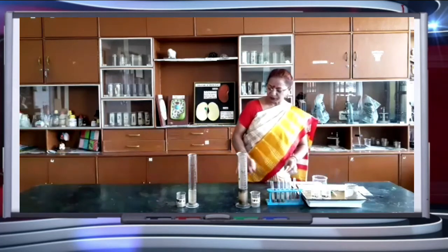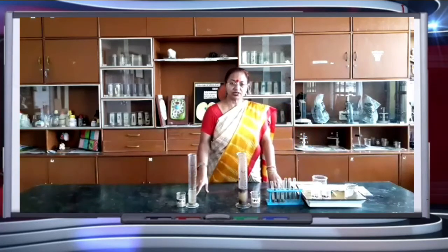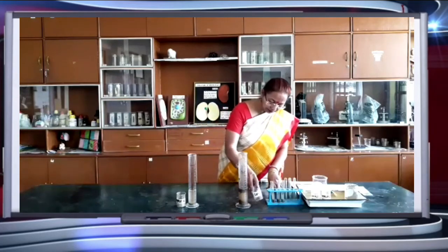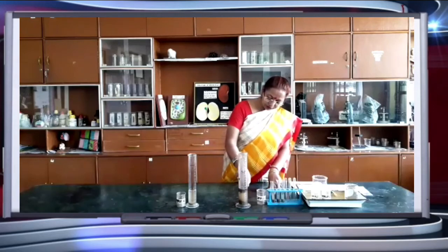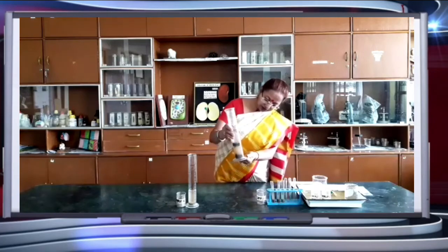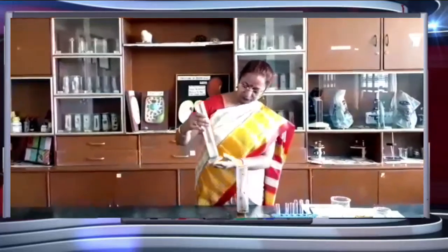Now by this time you can find particles have settled in these 2 measuring cylinders and are very clearly visible. Now here on the top in sample 2 you can find a layer of humus. So this is alluvial soil and you can find different layers. In this sample 1 you can find humus is very slight or almost nil. So this is sandy soil and all the particles are approximately of the same size and settled at the bottom, and a very thin layer of the fine particles we can see.